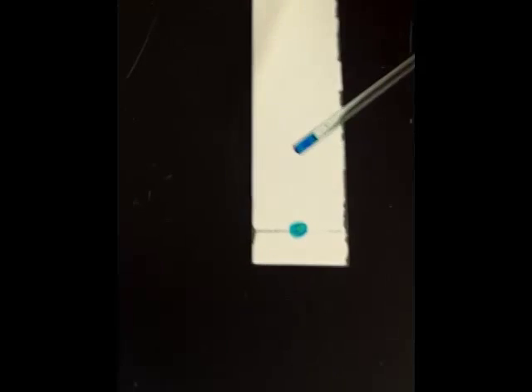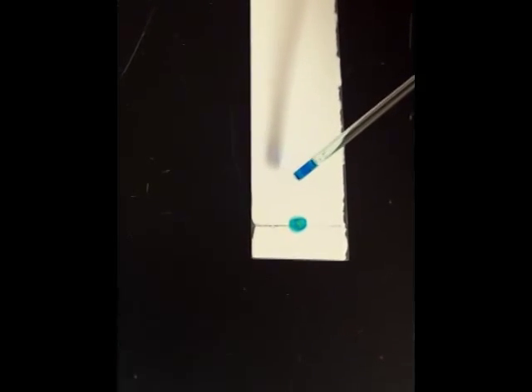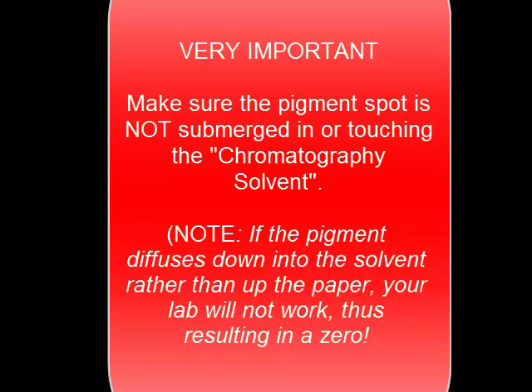I'm going to show you what would happen if you took your finger off and then you touch. So I have my finger off. Now watch what happens and it all comes out. If it gets too large, one thing that could happen is that it could all diffuse down into the chromatography solvent instead of going up and separating.